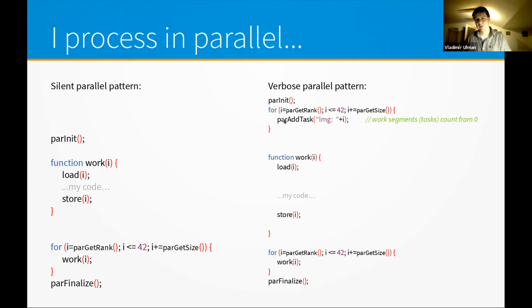Now, once this for cycle is over, this code is running on a node in an HPC center. We need to tell our laptop, our client, our Fiji, what progress bars, what gauges will be displayed. So with this function, we basically transfer the defined progress bars back. Now the running of the code continues. There is some function, okay, let's just skip it until we need it. And then the code crunching continues, right?